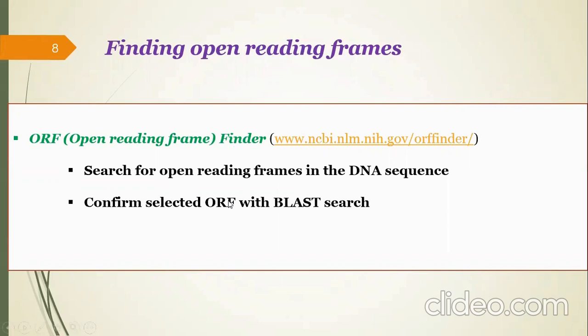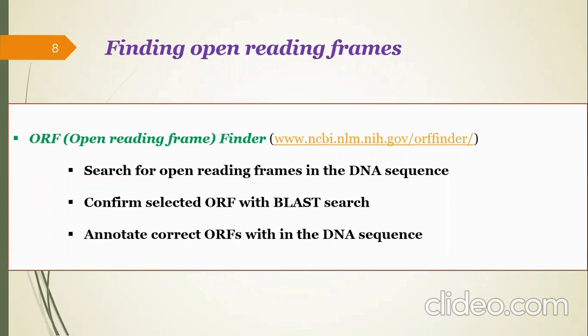To confirm a selected open reading frame, there is a BLAST option available there. Just click on BLAST and that open reading frame will be identified, whether it is an arbitrary open reading frame or an actual open reading frame, and it will annotate the correct open reading frame within the DNA sequence.